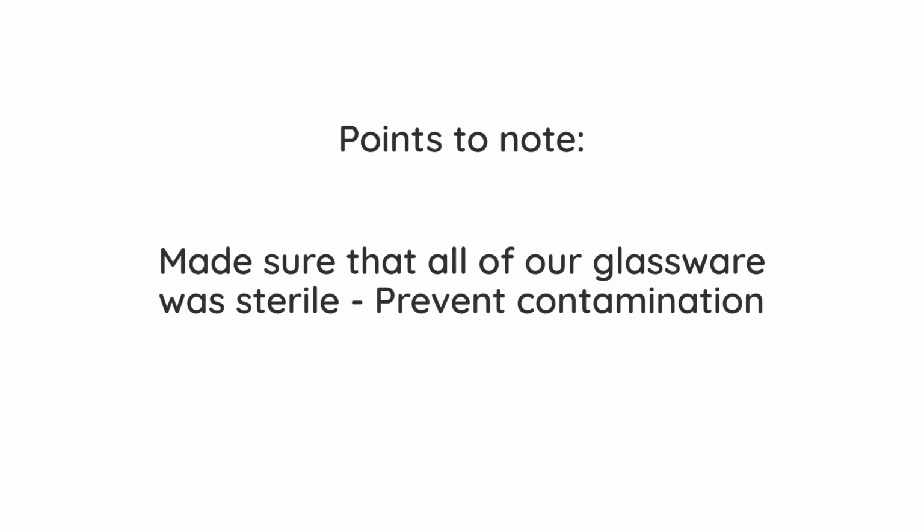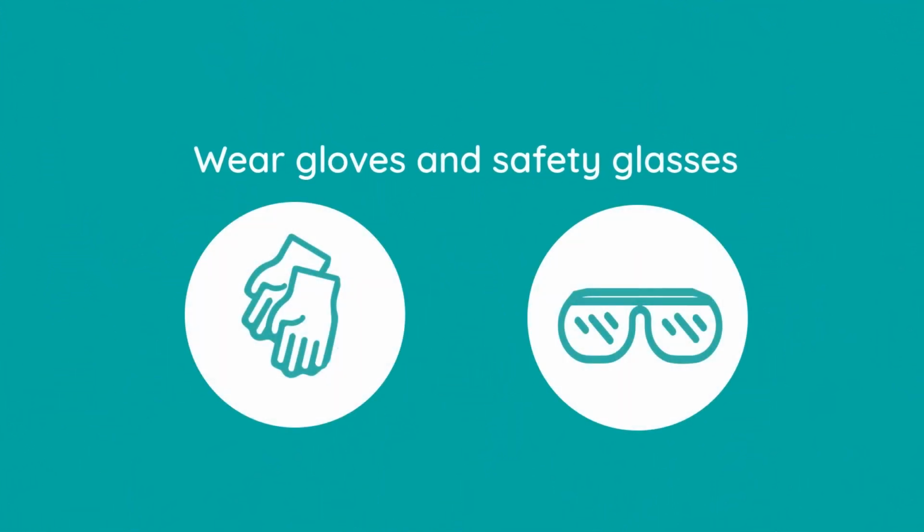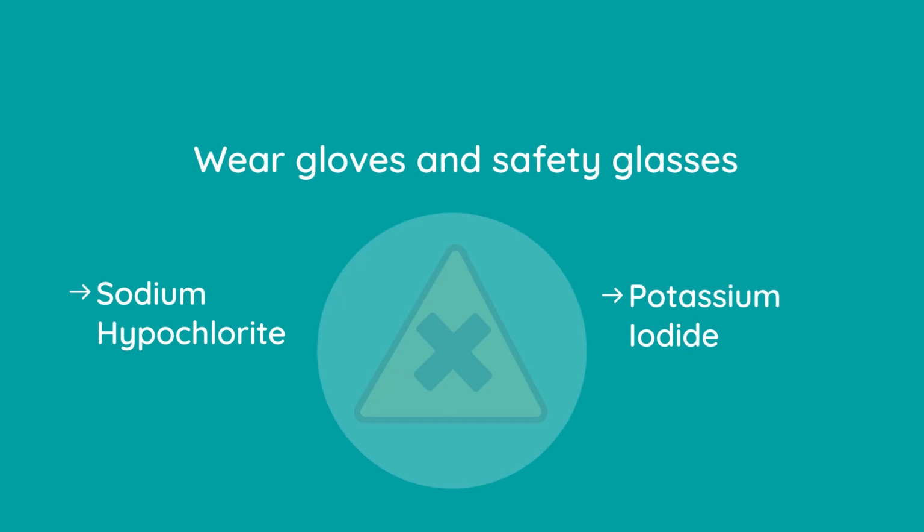Before we started this practical, we made sure that all of our glassware was sterile. This again is to prevent any contamination by other microorganisms. We also wore gloves and safety glasses during the practical, as both the sodium hypochlorite and the potassium iodide are irritants.